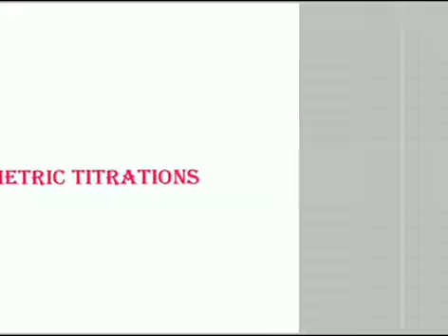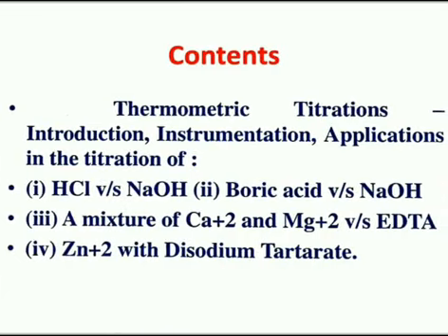And in this class, we are going to discuss the introduction, instrumentation, and applications of thermometric titrations, like the titration between hydrochloric acid and sodium hydroxide, and boric acid and sodium hydroxide, and the titration between a mixture of calcium and magnesium ions versus ethylenediaminetetraacetic acid, and we shall discuss other techniques too.